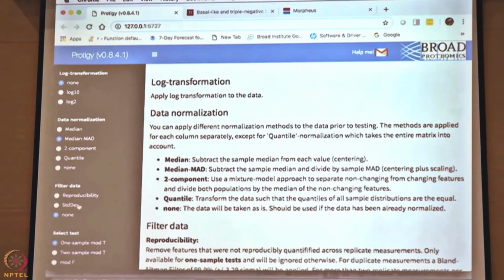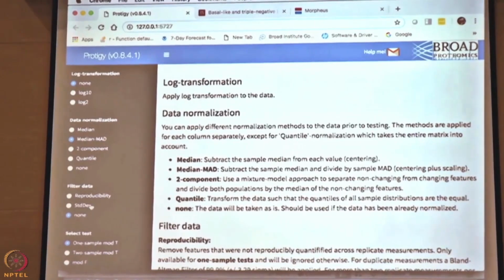This data set has about 15,000 proteins that came out of SpectrumMill with basically very minimal filtering. If a protein was missing in 90% of the samples, it is still here. If a protein did not change in any of the samples, it is still here. So, you might want to consider implementing some kind of a filter. Ideally, what we do in our analysis is have a missing value filter where things that are missing in too many samples are excluded.